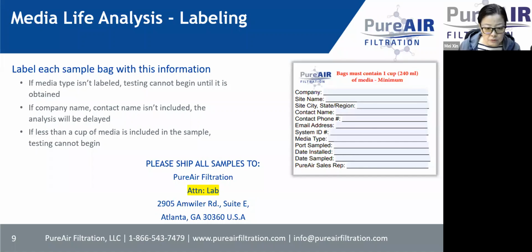But if you don't have enough, minimum 1 cup, or maybe you can call our sales reps to tell if it's critical, you don't have enough. We can figure out some ways for certain media, we still can analyze it.